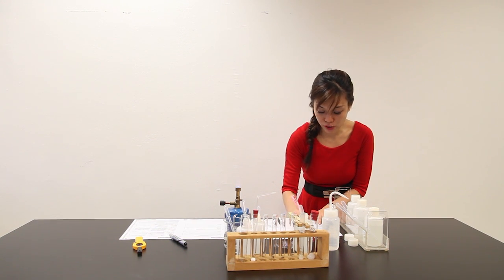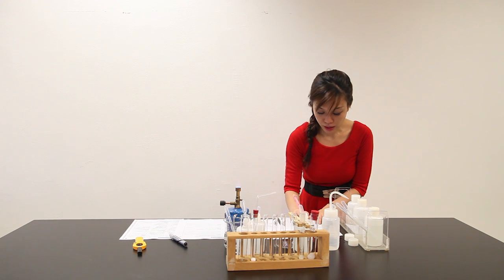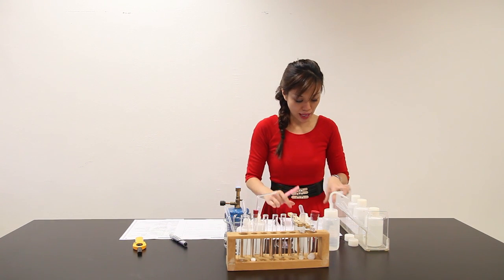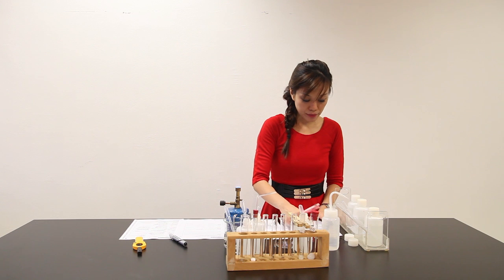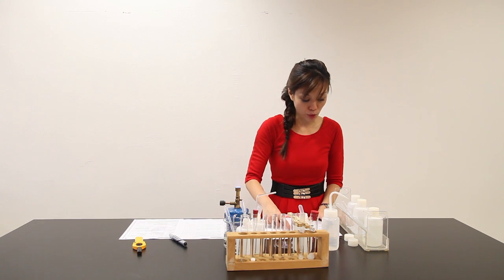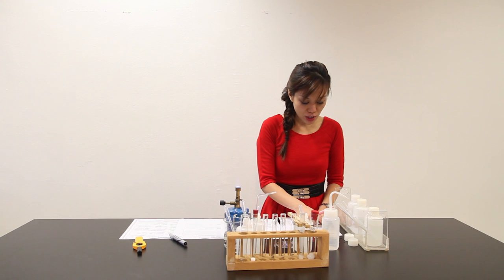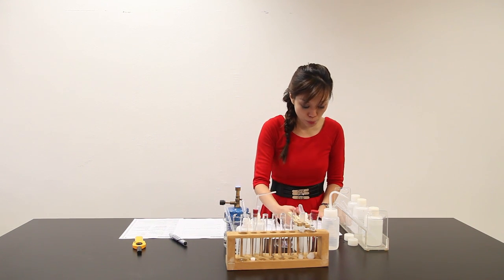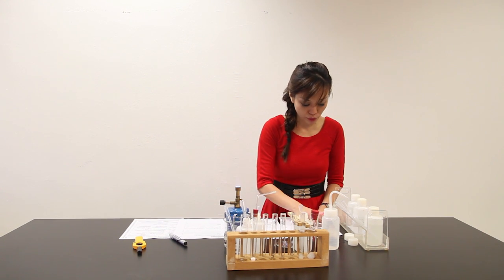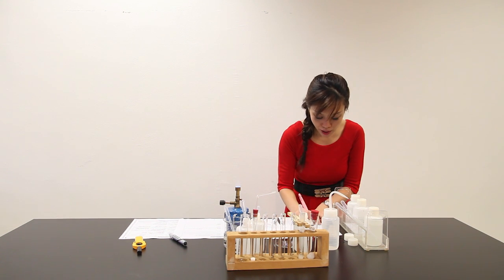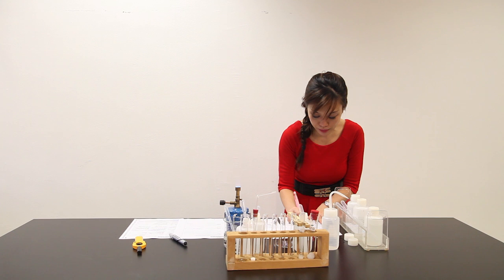Gas evolved turned damp blue litmus paper red. You can see over here at this portion they have dissected this part of your paper into two parts. When you talk about the observation with the litmus paper, you should be writing at the second portion of the paper here. Also, you have a glowing splint, so it relights the glowing splint.